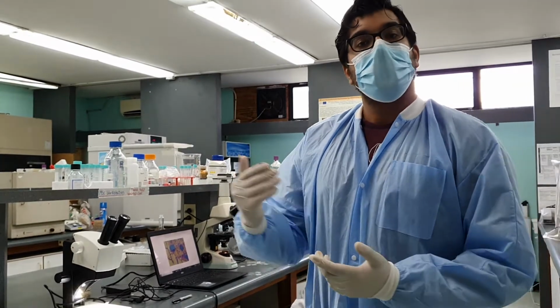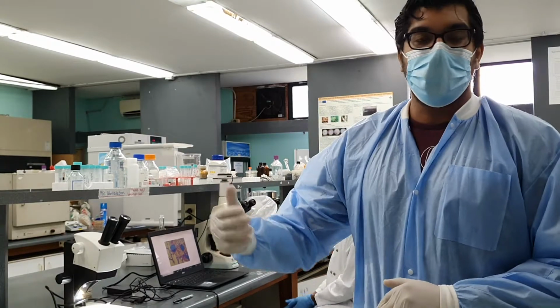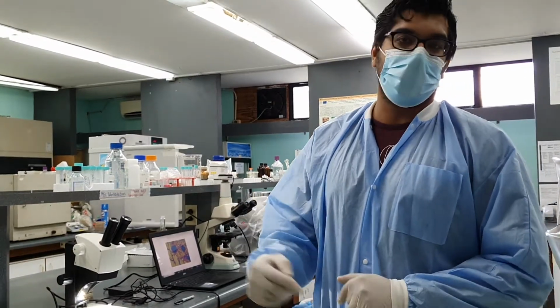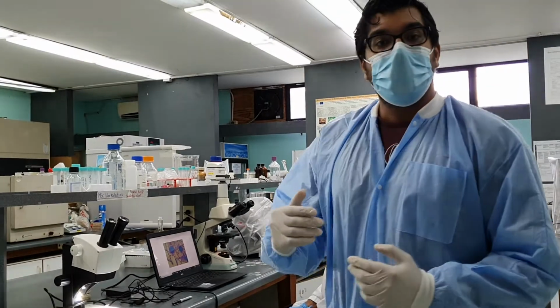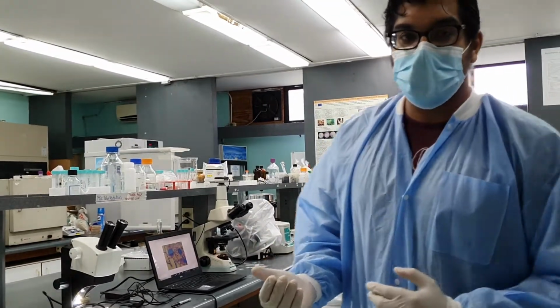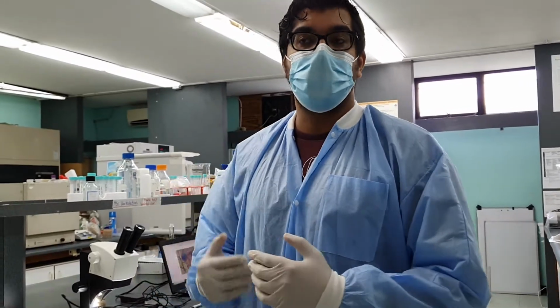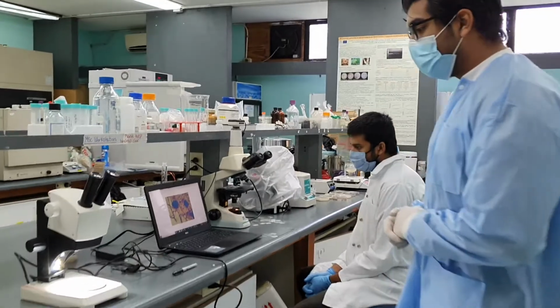In this lab, like we discussed in class, we're going to go through the morphological and reproductive structures of two different classes of fungi and two different types. I just want to run through a brief introduction with you all, right? So remember, like we discussed in class, fungi are a type of eukaryotic organism, right?